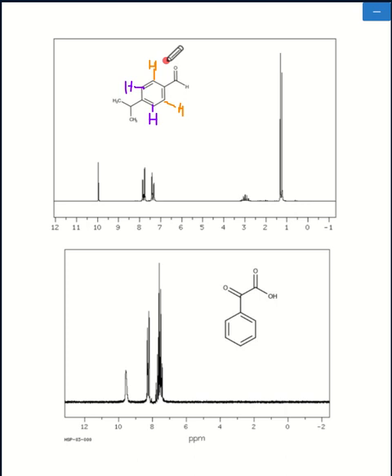Therefore, this aldehyde group will cause this hydrogen environment and this hydrogen environment to show up separately. So basically, that's why around 7 to 8 parts per million, despite those hydrogen being on a ring, they actually show up as two unique hydrogen environments. So one of these belongs to one of these guys, and the other belongs to, well, the other.